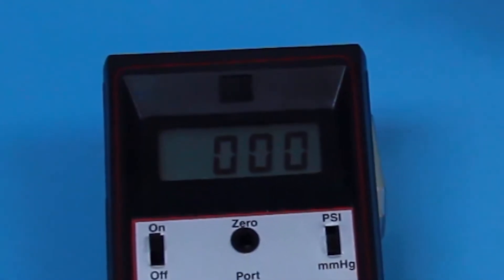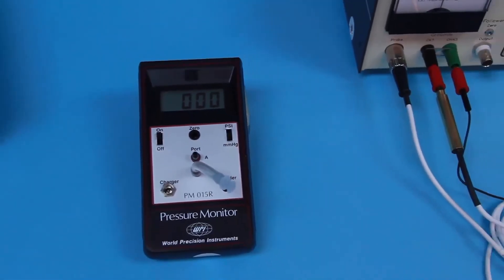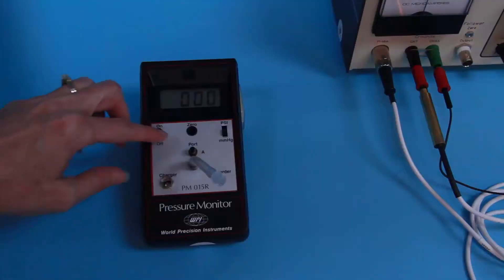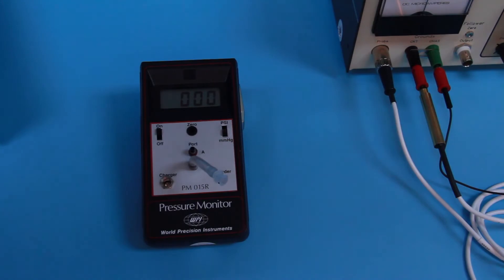Pressure can be read on the built-in LCD display or relayed to a chart recorder, oscilloscope, or computer. A range switch allows measurement in units of psi or millimeters of mercury.